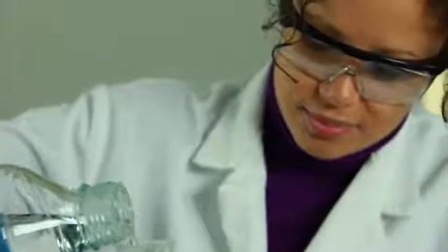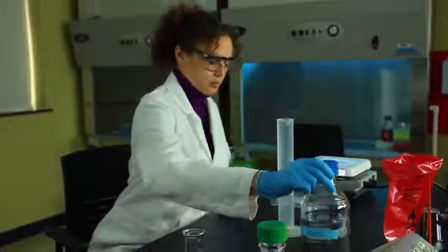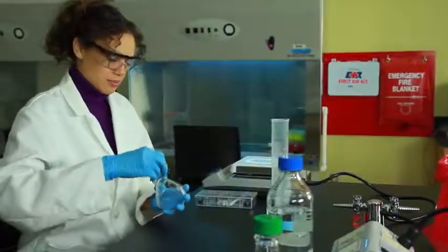Always check the lot number and expiration date. The right panel lists the composition of the media and the final pH. First, add 100 milliliters of deionized water to a graduated cylinder. Place a stir bar in a 250 milliliter flask.